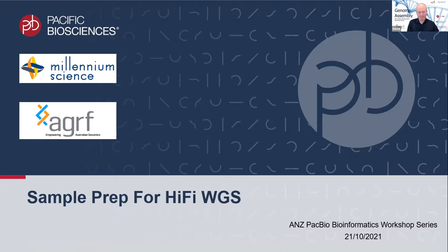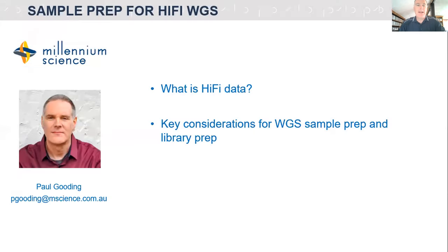Thank you, Paul. Well, thanks, David, and thanks to all the panelists for being on and for everyone that's joined. So as David said, I'm Paul, I'm FAS with Millennium Science, and we're just going to skip through in the next sort of 10 minutes very briefly before we get into the bioinformatics of actually what is HiFi data, how is that generated from the sequencer, and also the key considerations for whole genome sequencing, sample prep and library prep, both of which are key for getting good quality data.